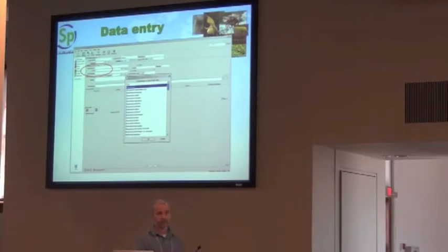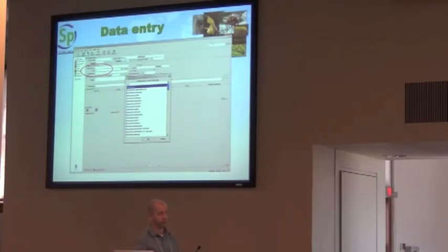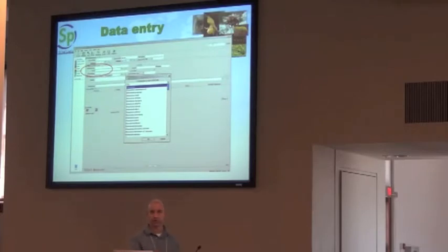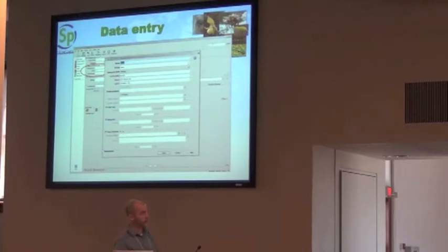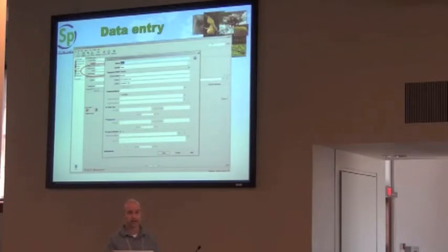You go in and type in the first couple of letters of a species name, and it gives you a drop-down list of available entries in the taxonomic tree that you can choose from. The synonymy driven through the trees is also displayed on the forms, so you can keep track of old names and new names. If the name isn't in the tree, it'll take you directly to the taxonomy data entry form so that you can enter that new item into the tree as you're entering specimens.